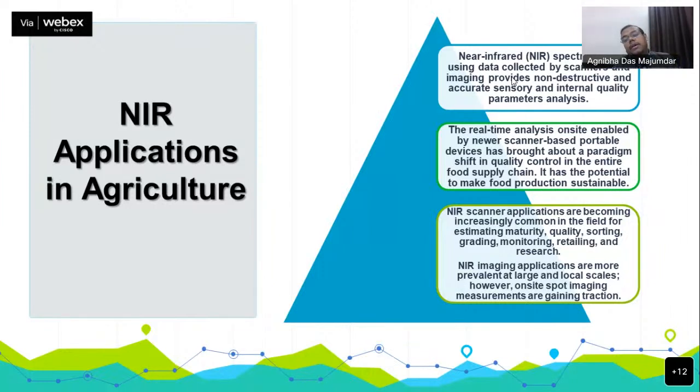enabled by newer scan-based portable devices, has brought about a paradigm shift in quality control in the entire food supply chain. So as we know, every food industry, every food company has some department called quality control or quality assurance. The function of that department is to ensure the quality of every food product after industrialization, after the production. They have to check the quality parameters of those food products. So for this, some portable NIR instruments have been designed.